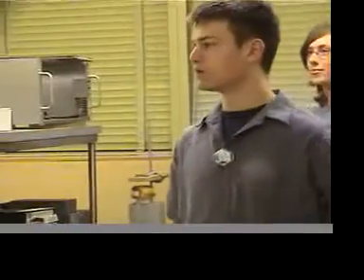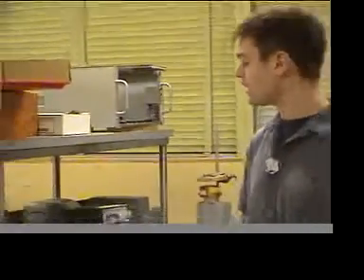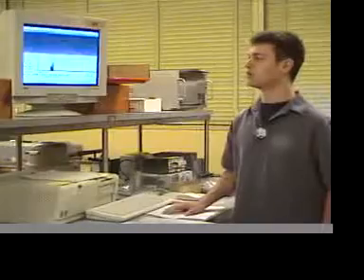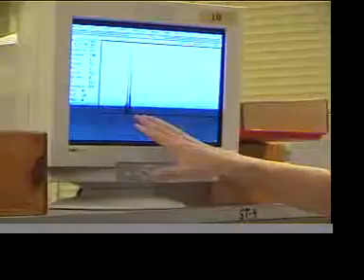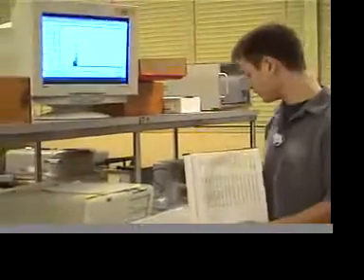Like Kevin said, we need to calibrate our system so that we are able to determine the energy levels of each of the channels for unknown sources. Now what we do is we take a known source such as iron or nickel or zinc, and we take a spectroscopy of them in order to find out what channel numbers get lots of hits. Then we look up in a table the energy levels of the common transitions and the relative intensities, because there are usually multiple transitions corresponding to the kappa alpha and the kappa beta transitions.